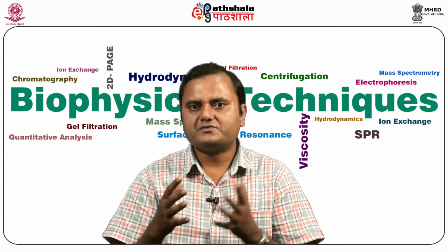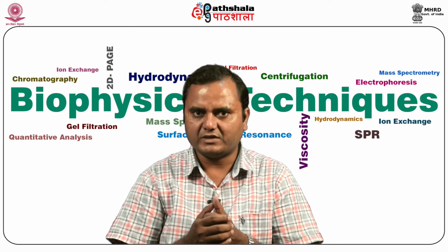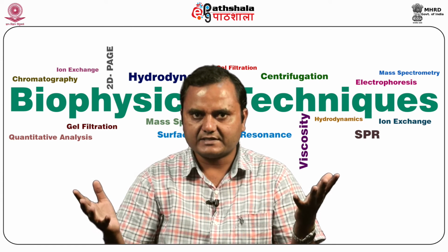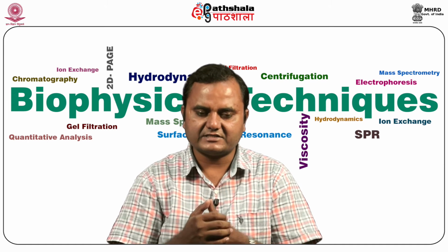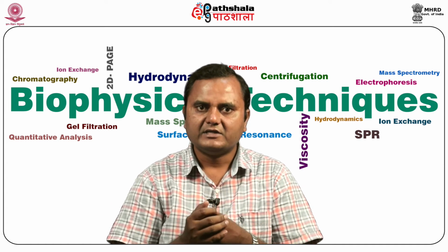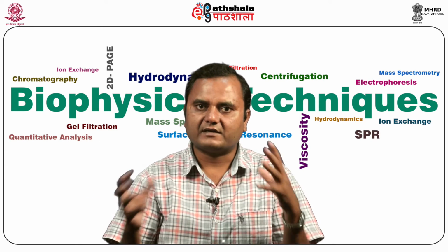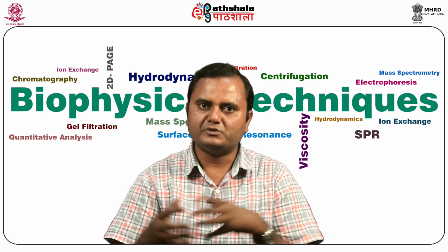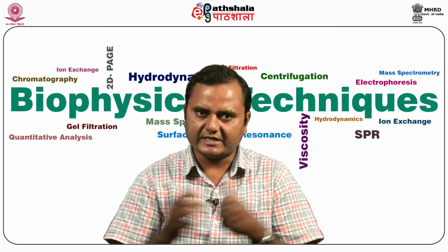It is also used for the determination of subunit stoichiometry. For example, if you have big biological complexes like DNA polymerase or many proteins that exist in the form of oligomers, you should know how many subunits are there, and what the ratio of these subunits is as per their size, like heterodimer, homodimer, and in that term.